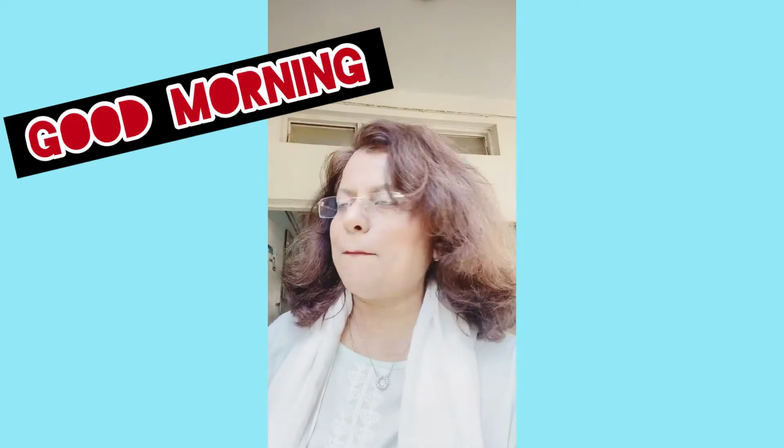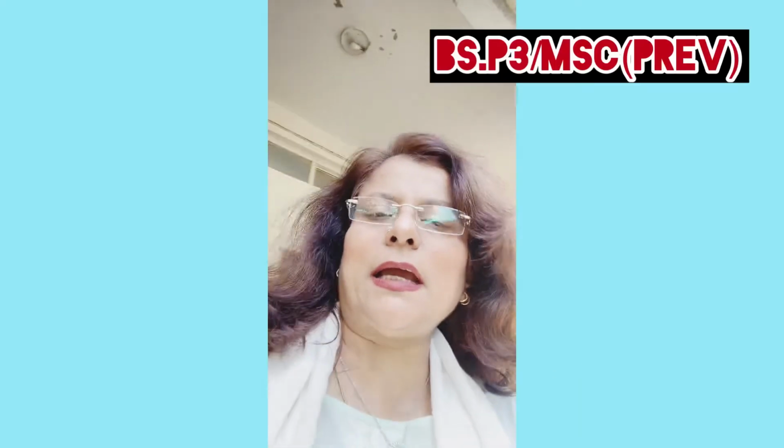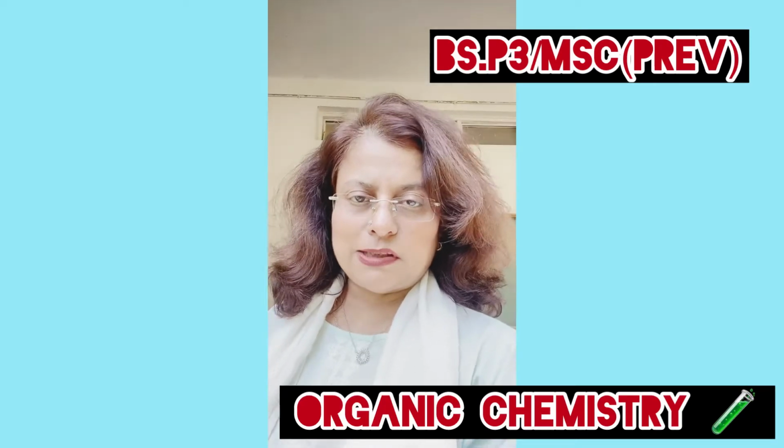And I'm back again with my students. I'm standing just near my lab, BS Part 3 and MSc Previous Organic Chemistry lab. So I assigned my students the first experiment. I gave them the general introduction, and today they are going to start their experimental work. They are going to start with the first synthesis of their first organic compound, which is P.Nitro acetanilide, because it has very simple steps, and they can easily do it because practically they are not that good.